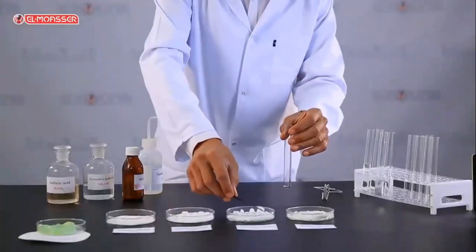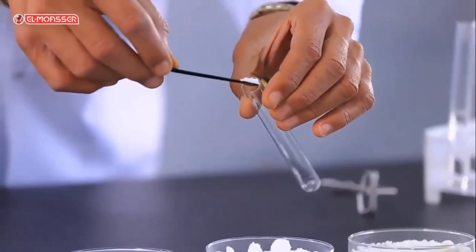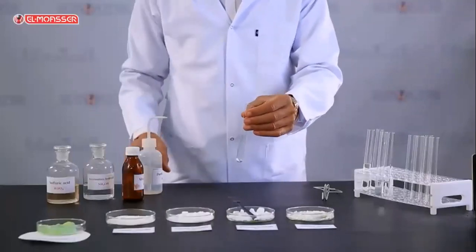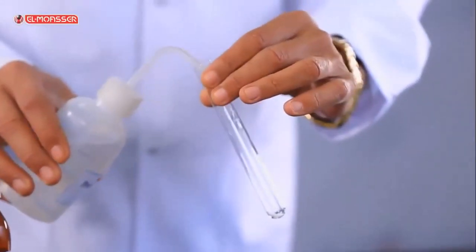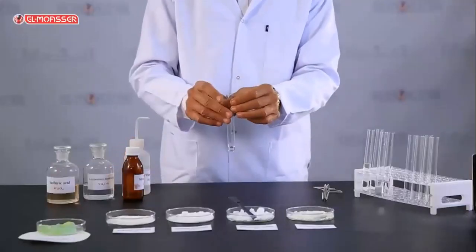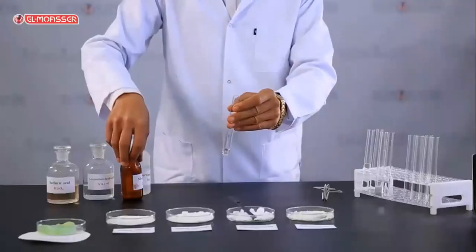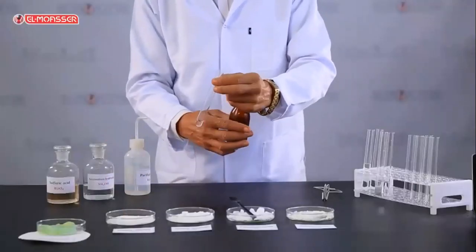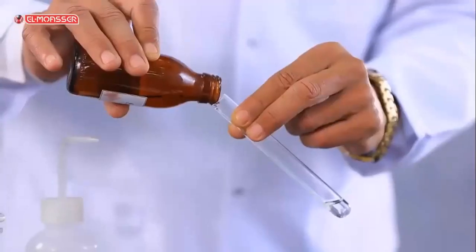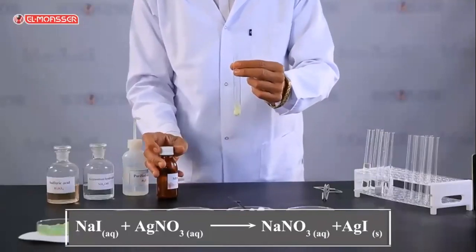Confirmatory experiment. Add a small amount of sodium iodide to a clean test tube, then add distilled water with shaking to form a salt solution. Then add to it silver nitrate solution. What do you observe? A yellow precipitate of silver iodide is formed.